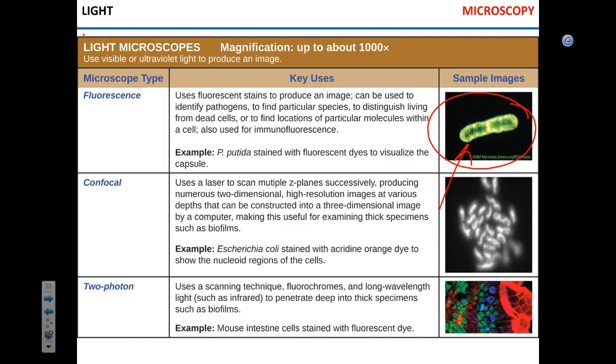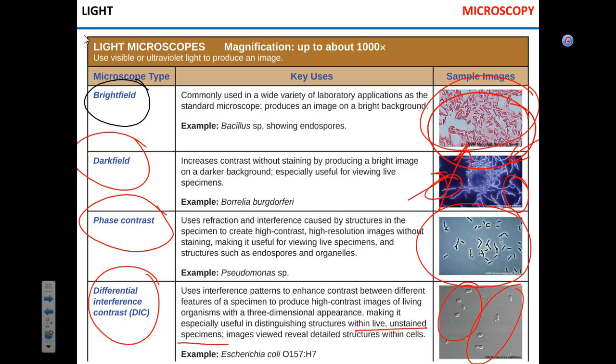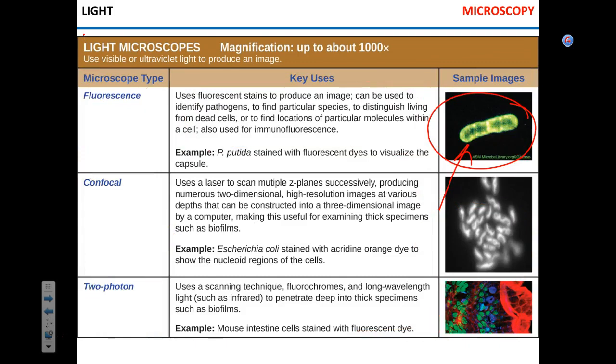I mentioned mycoplasma. Remember we mentioned this microorganism as the one that doesn't have a cell wall. Mycoplasma is exquisitely small and it's really hard to see it using conventional bright field microscopy. This one doesn't work with mycoplasma. And mycoplasma is a scourge of various biotechnological processes. It can contaminate all kinds of biological systems. So in order to detect mycoplasma, you can take a bunch of human or animal cells that you cultivate. You can add a special dye that interacts specifically with mycoplasma.